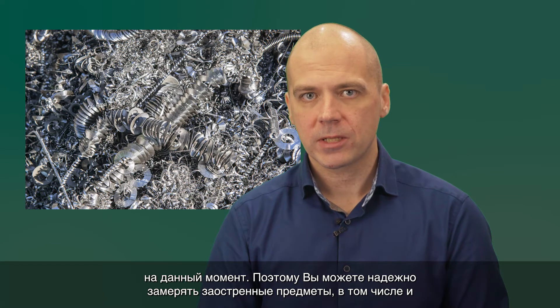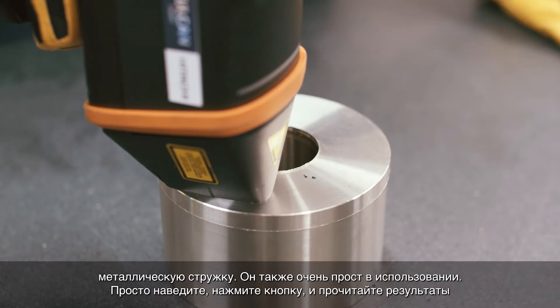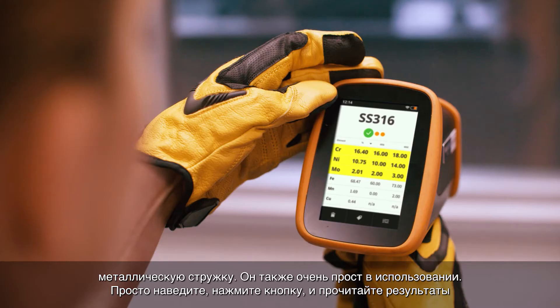The LIBS analyzer is very rugged, because the detector is typically protected by sapphire glass, one of the hardest materials known today. So you can safely measure sharp and pointy objects, including turnings and shavings. It is also very easy to use — just point, shoot, and read the results from the screen.